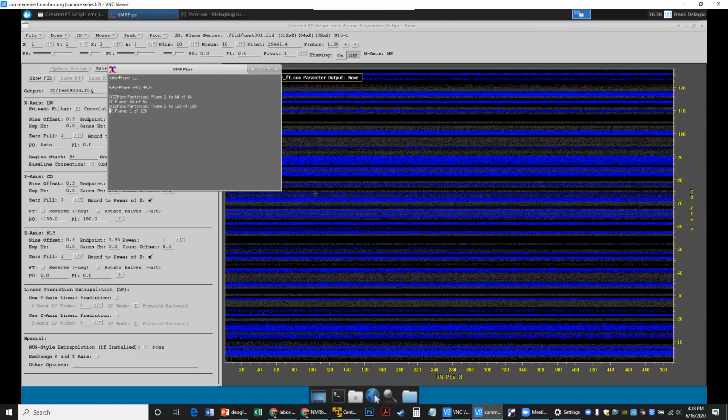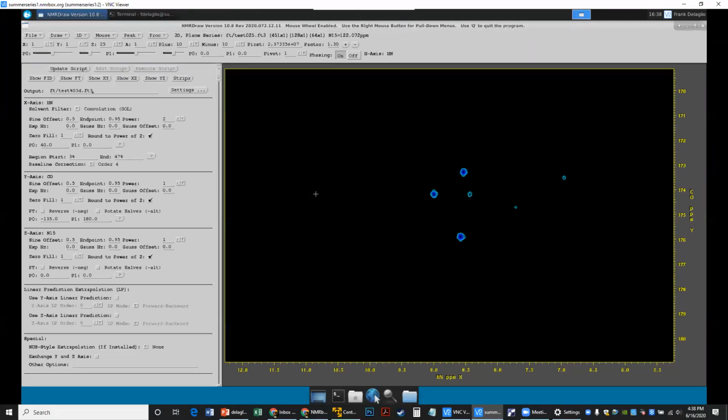So this is a great question, and the answer is subtle, but fun to know. For a case like this one, where we have the equivalent of minus 90, 180 phase correction, if there were no phase correction at all, it would mean that the phase of the peaks changes linearly from one position to another, which is what we saw in the originally processed version of the data.